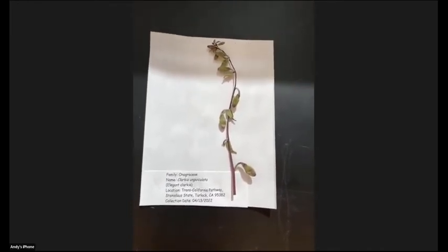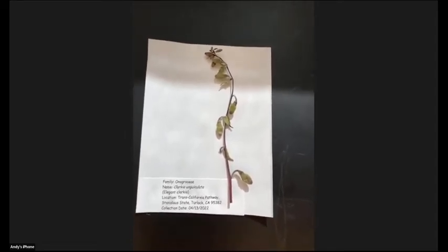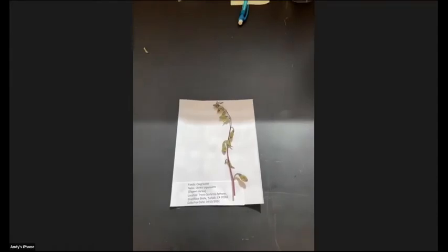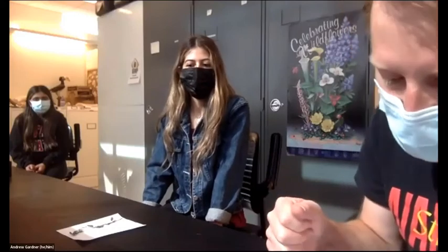I hope that your specimens are looking good. We'll give people a couple of minutes to make some specimens. And then if any classes want to share pictures of their specimens, we'd really like to see how they're looking. So different classes have different plant specimens. We sent out different species in our kits. So some people have Clarkias, other people have oaks, some people have California poppies. And some people have California redbuds or Western redbuds.